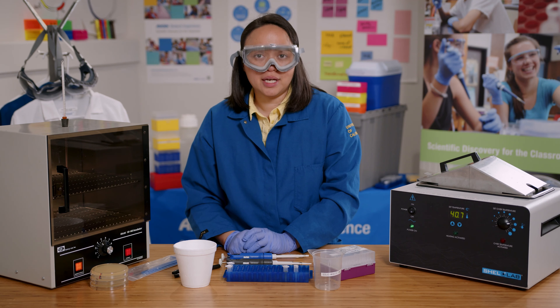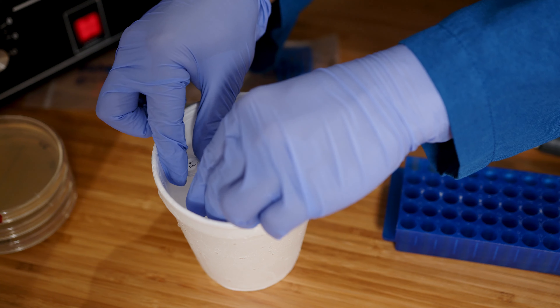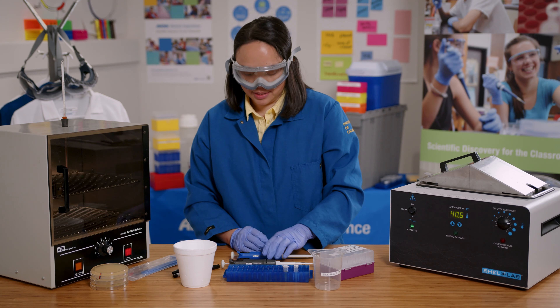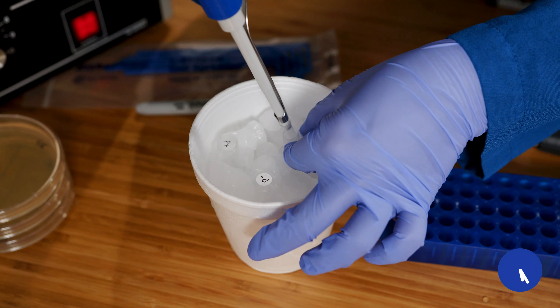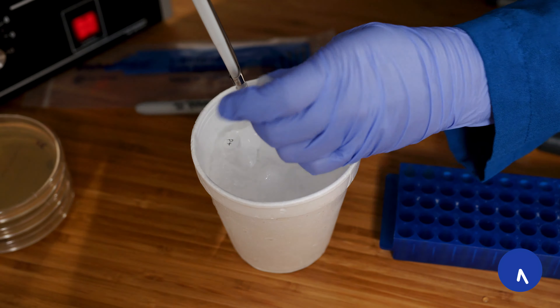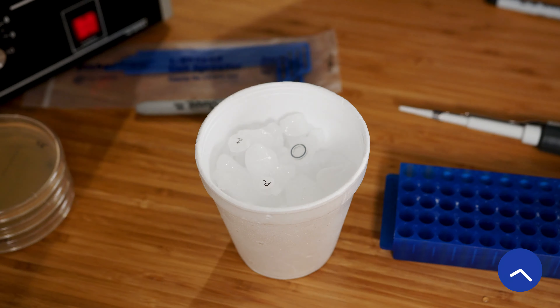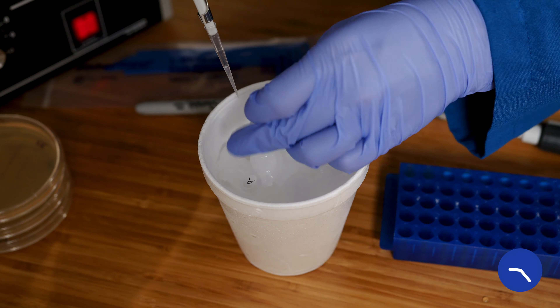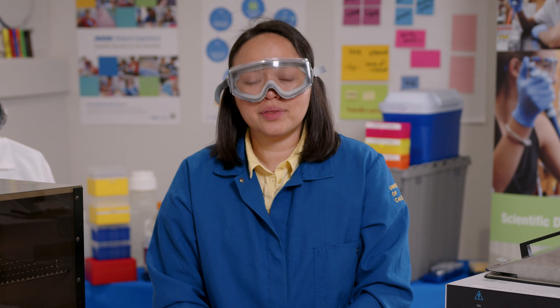Since I want to keep everything as cold as possible, I'm going to keep my tubes on ice while I get 50 microliters of competent cells. In class, your teacher will have the competent cells and will aliquot them directly into your chilled tubes.